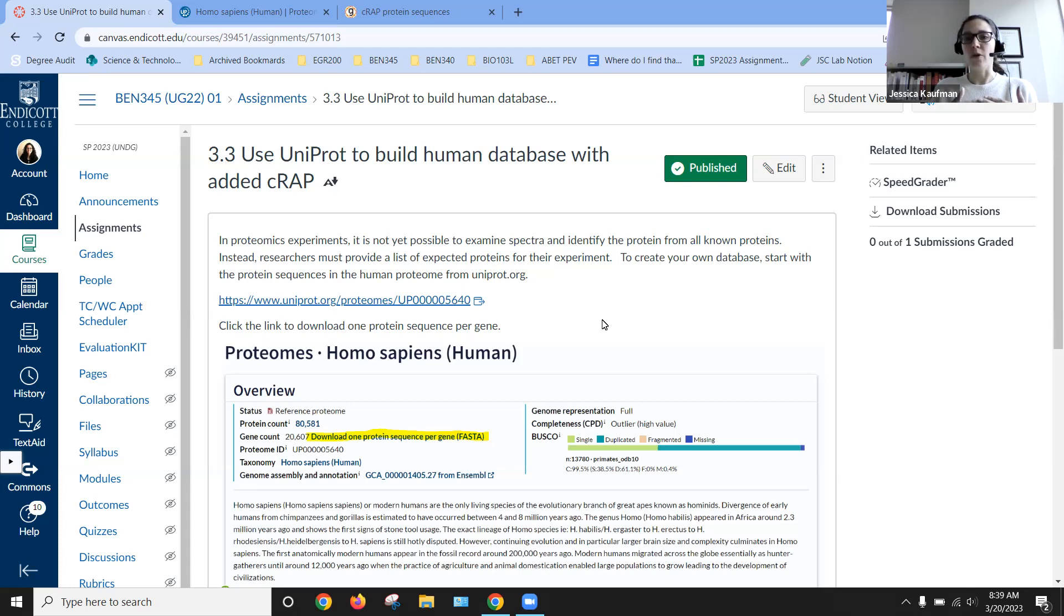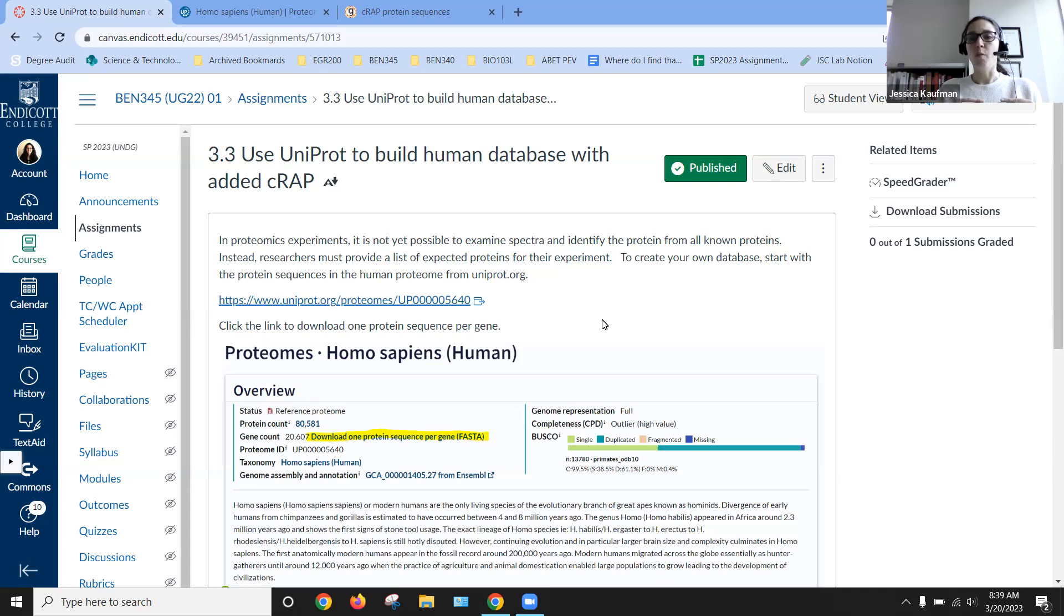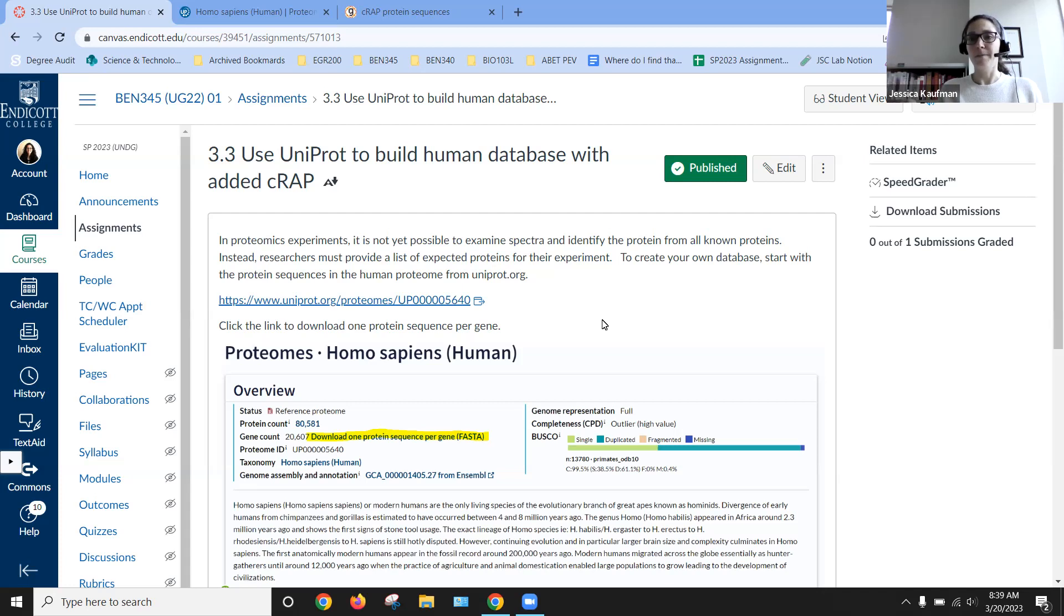So the raw file that we get from our instrumentation is going to tell us when particular m over z ratios were detected during the experiment.